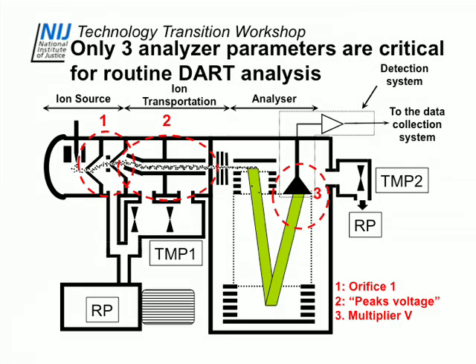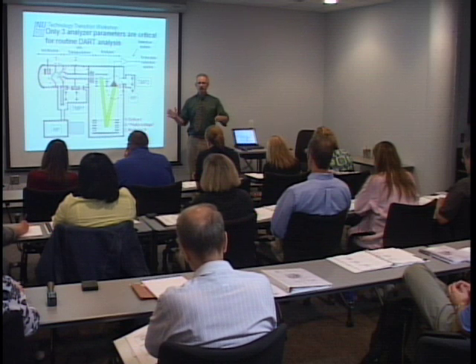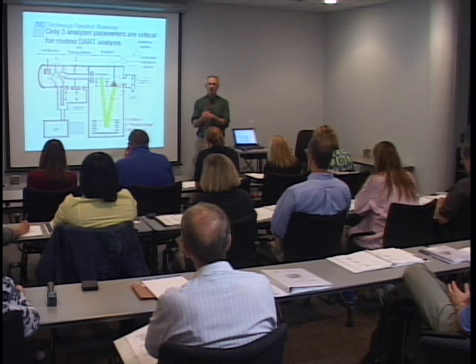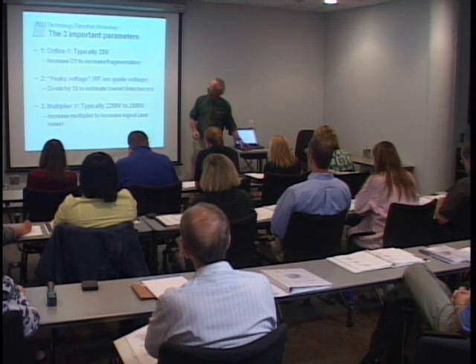One of them is the RF ion guide voltage. Well, let's start with one. One of them is the difference in potential between those two skimmers. If it's a small value, the ions just kind of drift through there and they don't break apart. If it's a high value, the ions bump into gas molecules and they break into pieces. So changing that parameter will be important.